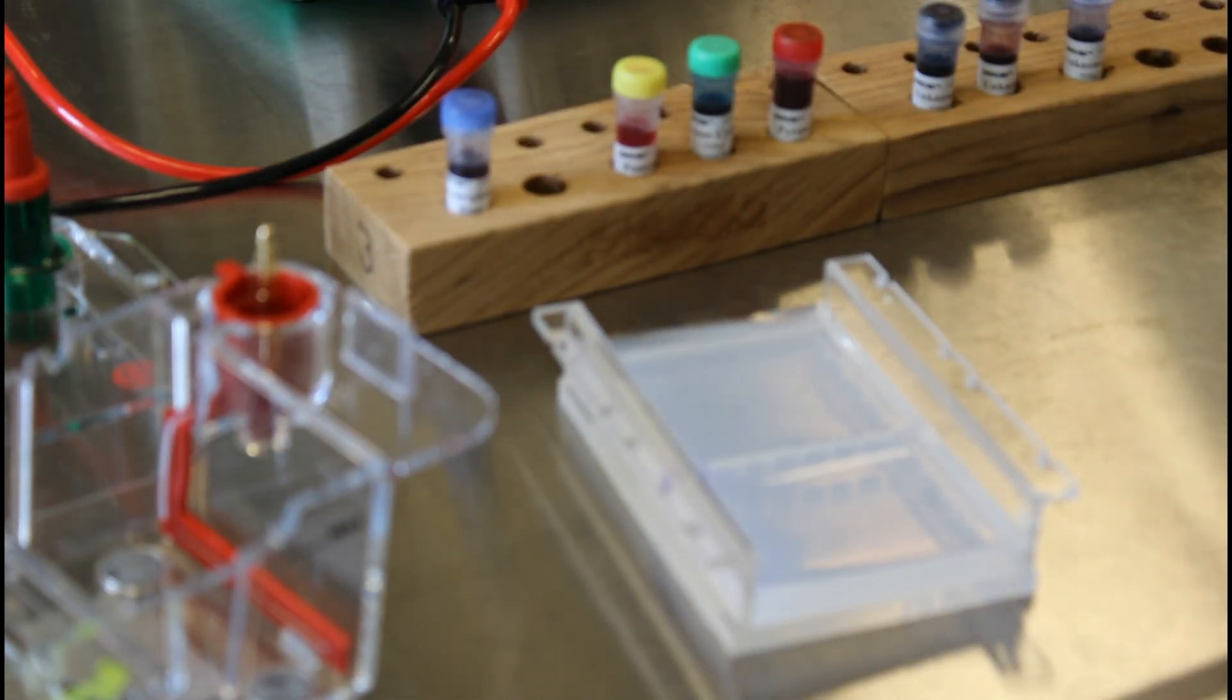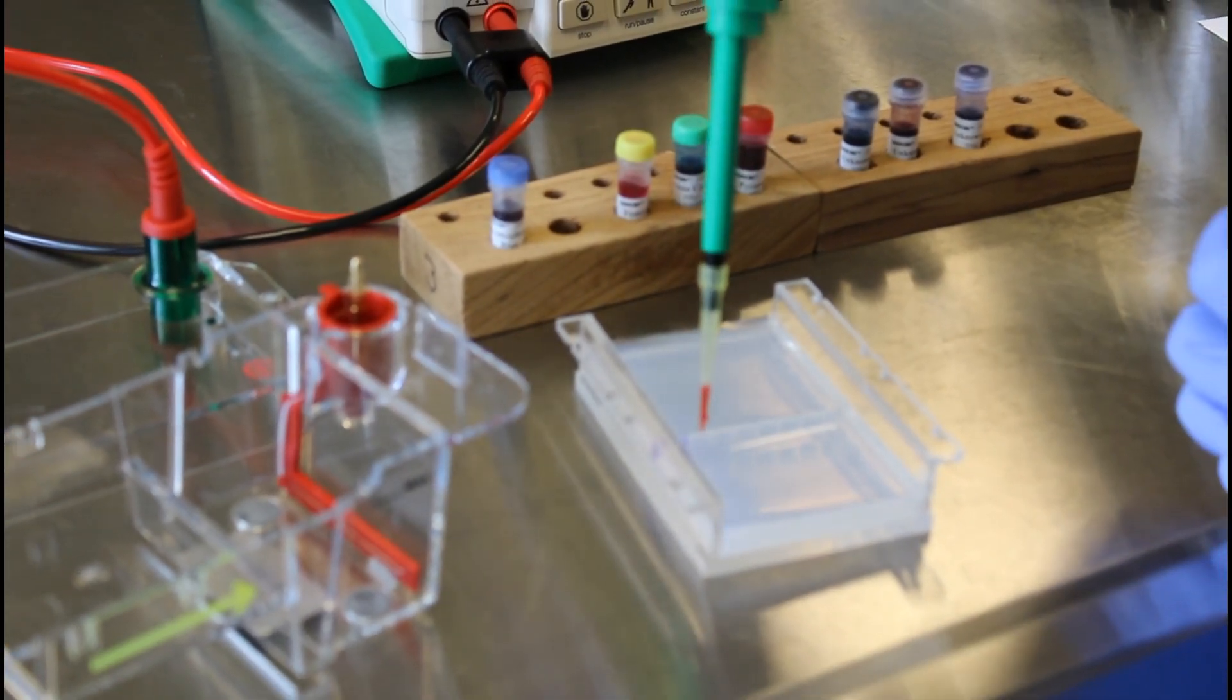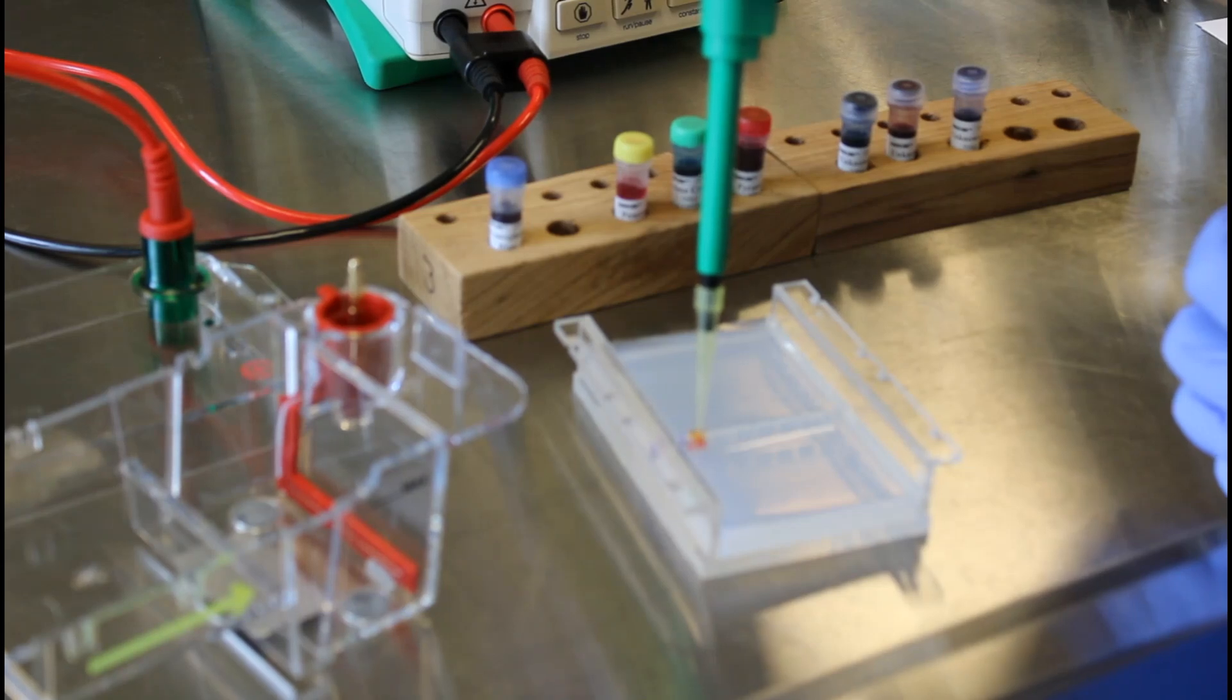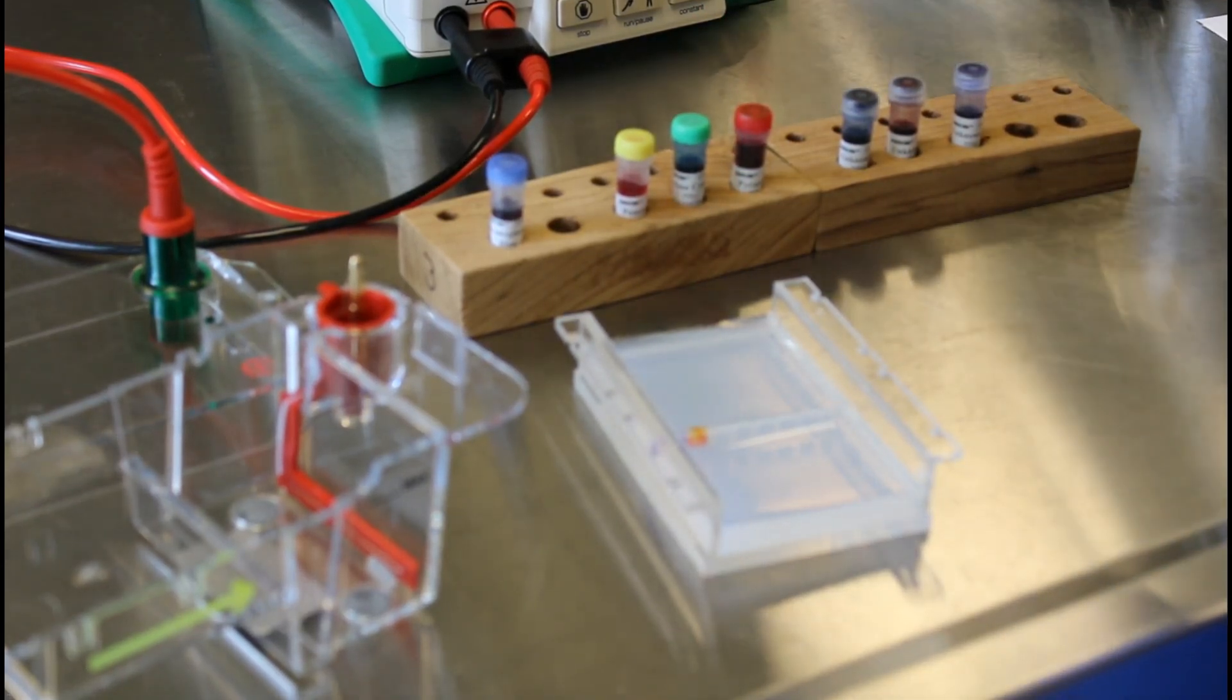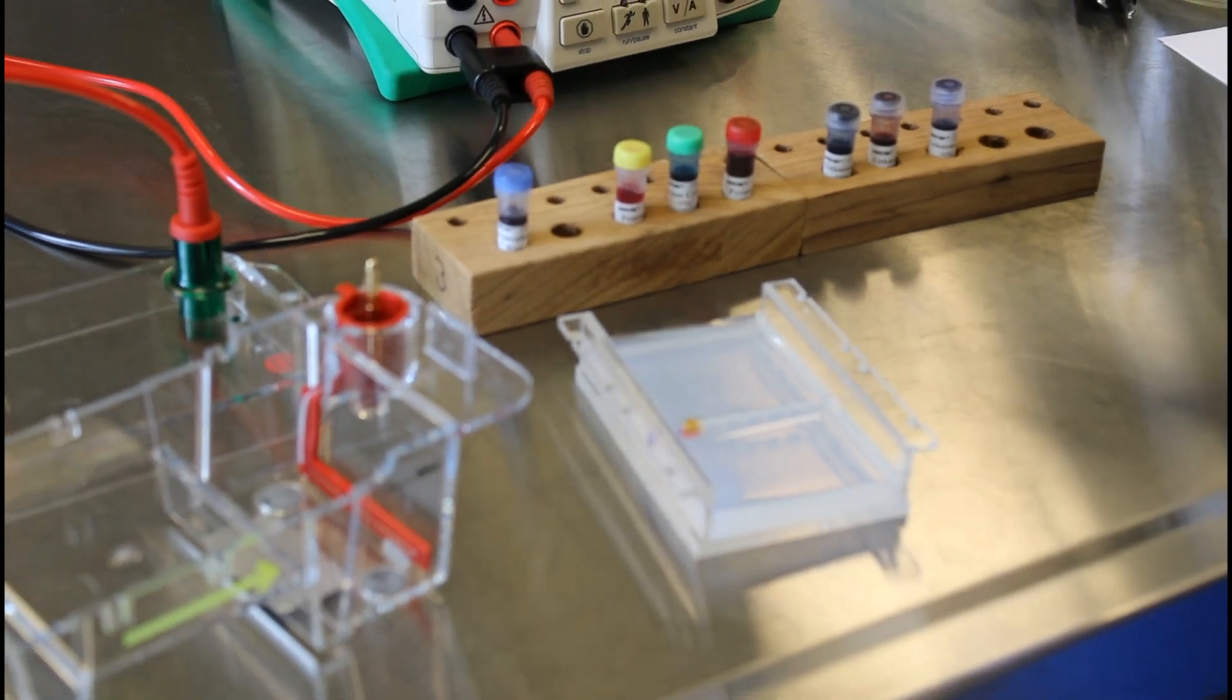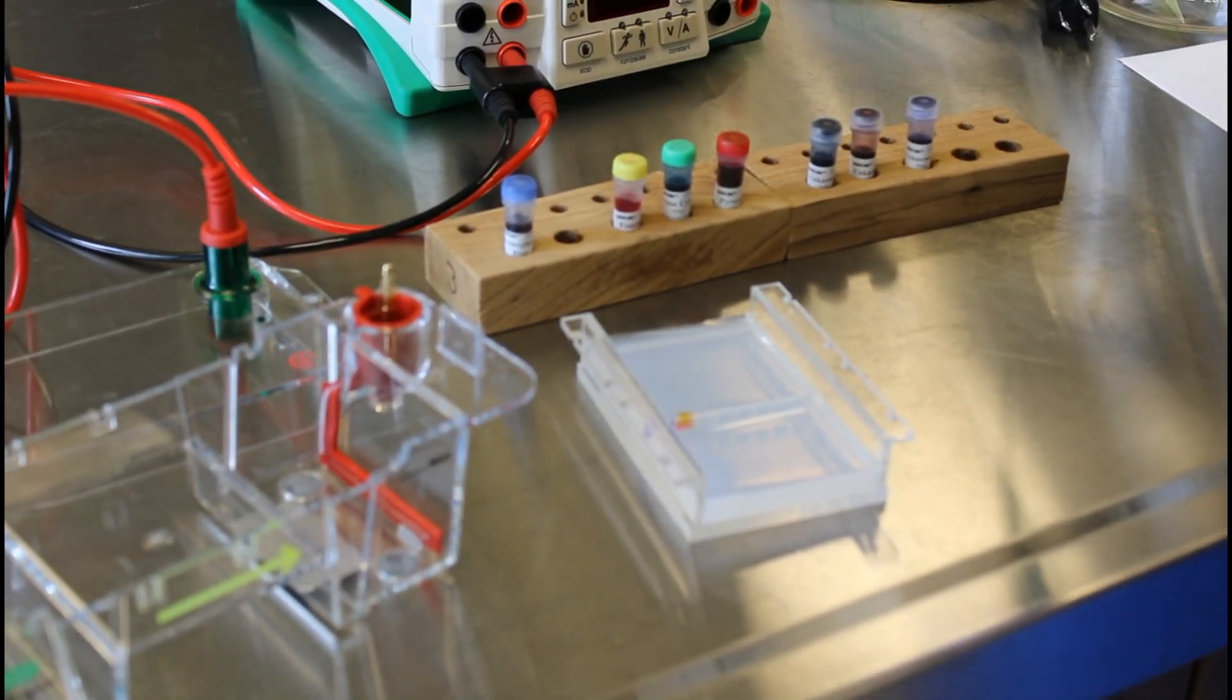In the next well I'm going to grab a new tip and put this methyl orange dye. Once again 20 microliters. It's kind of difficult to make sure you get it in the well. I spilled a little bit on that one. Hopefully it doesn't screw things up.